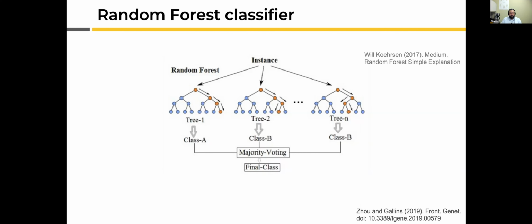And so with random forest, it generates a number of trees, say 1,000 trees, and each of those 1,000 trees gets a small subset, 5, 10, or fewer, of the total set of features. And then the algorithm builds a decision tree, a classification tree, based on that small subset of features. And then it classifies all of the samples based on their labels. And you get some classification percentage for each of the trees.